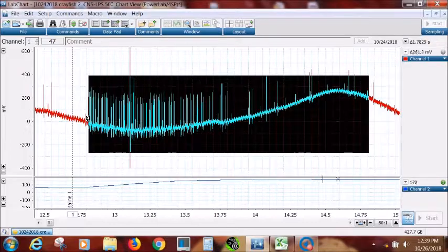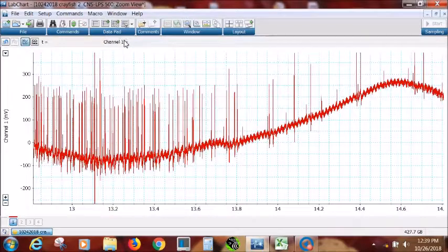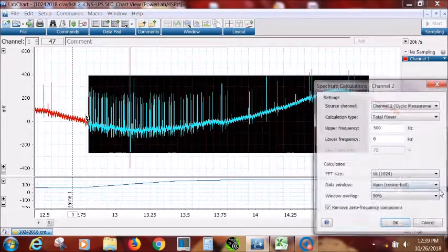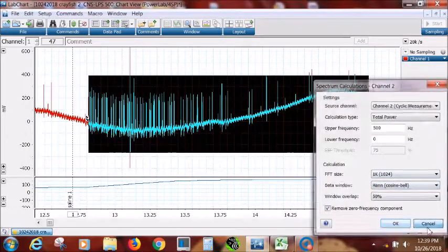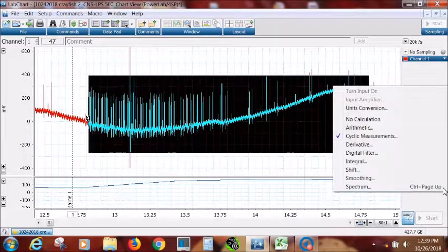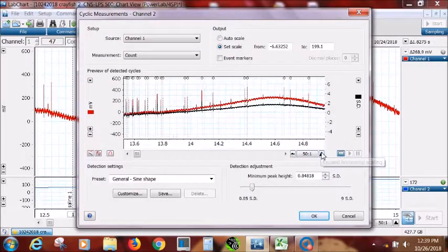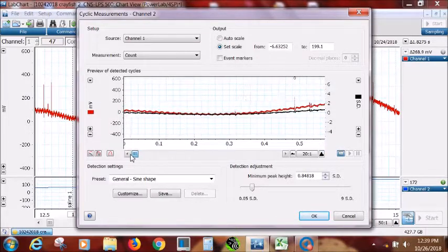But anyways, now you see that black spot. If you hit the zoom, it will zoom into that spot that you just hit. If you go back to the chart view, then it goes back to this. So this is our analysis, and we saw that when we did this cycle variables, for example, we see that it's counting those values throughout there, and we can zoom in again, and you can see where you were.